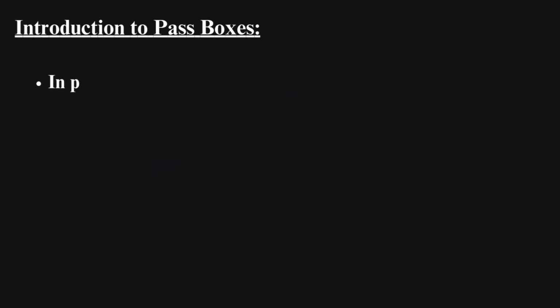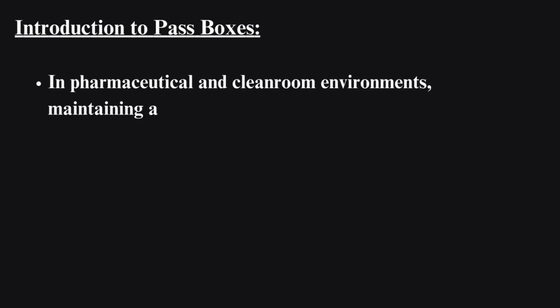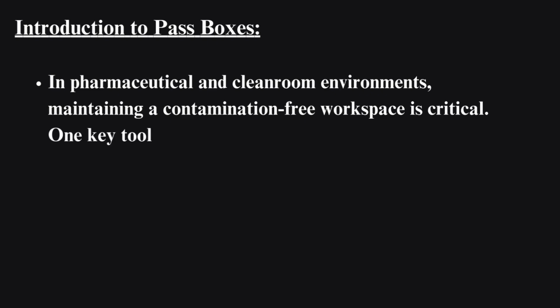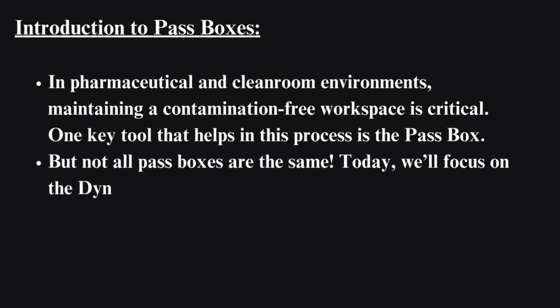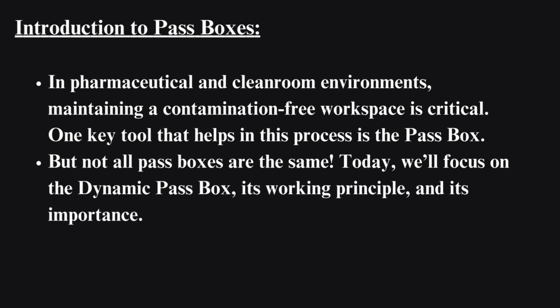Introduction to passboxes. In pharmaceutical and cleanroom environments, maintaining a contamination-free workspace is critical. One key tool that helps in this process is the passbox. But not all passboxes are the same. Today, we'll focus on the dynamic passbox, its working principle, and its importance.